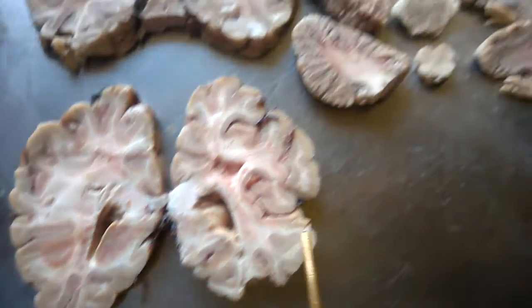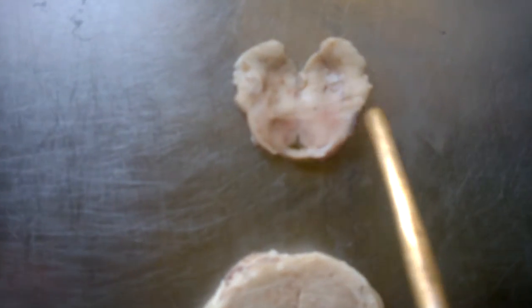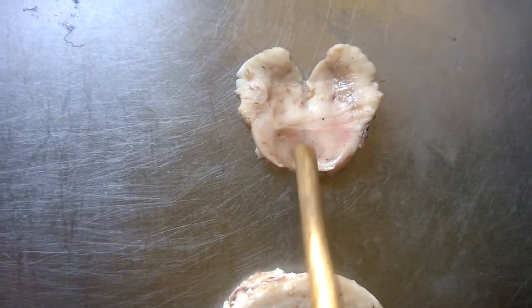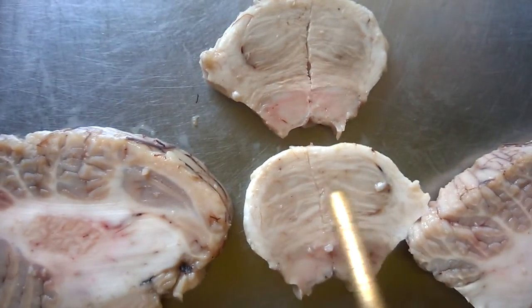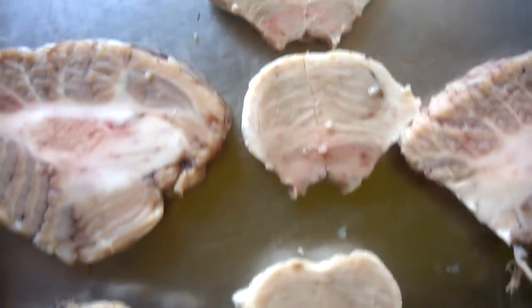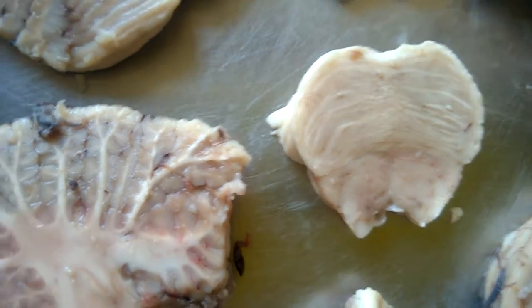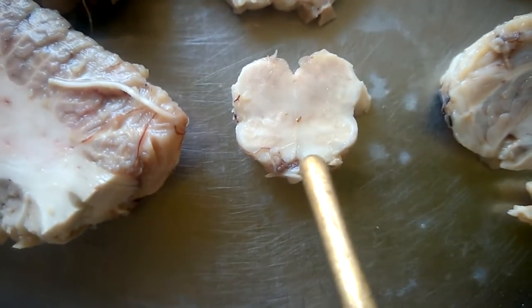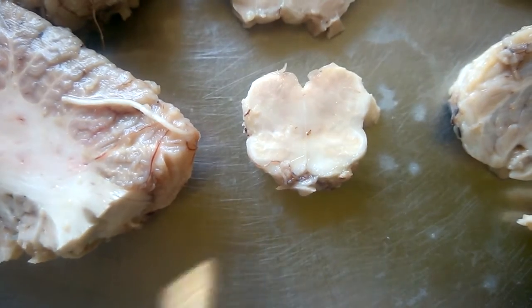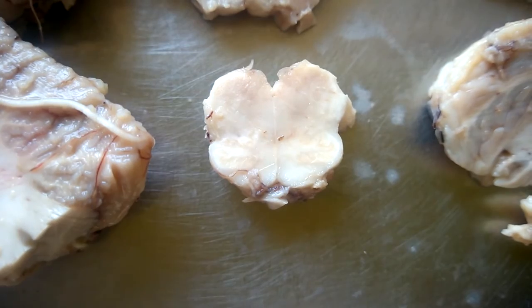Now we'll go to the brainstem. This is the midbrain, and what we see is the substantia nigra. Here we can see the red nucleus. This is the aqueduct of Sylvius. This is the pons. You can see the decussation here, the pontine decussations, and this blackish pigmented area is called the locus ceruleus. And then we go to the medulla, and here this is the olivary nucleus of the medulla. It will be a little difficult to appreciate, but that is the olivary nucleus of the medulla.